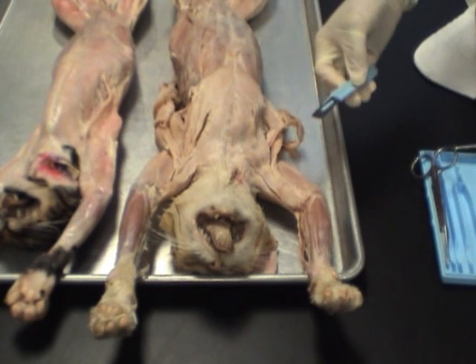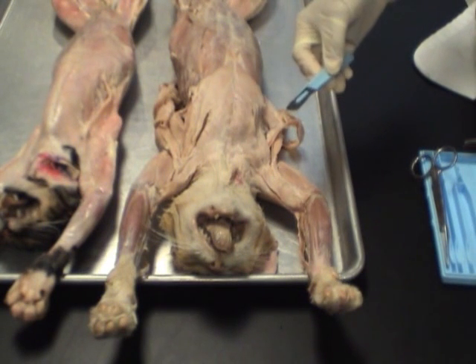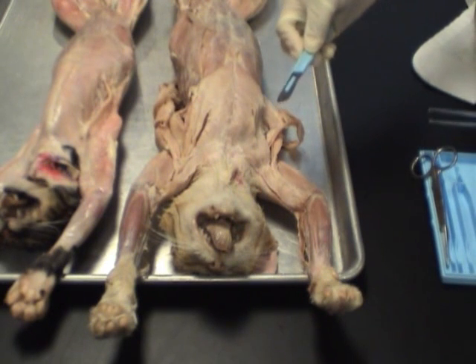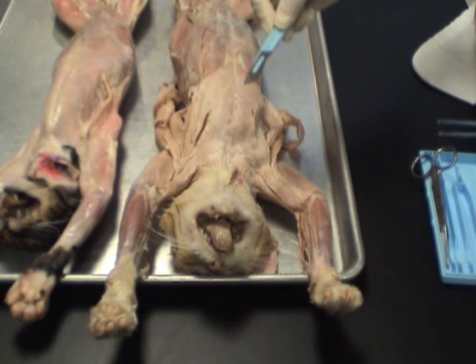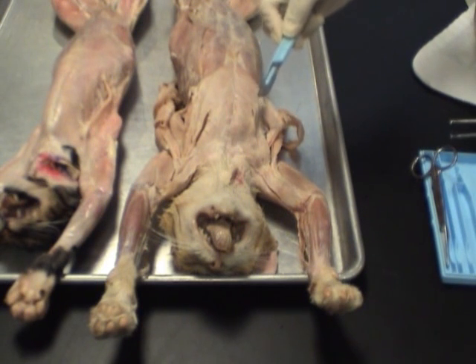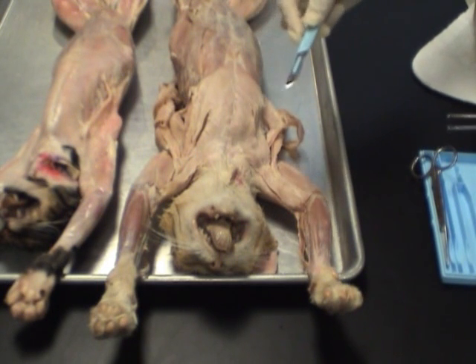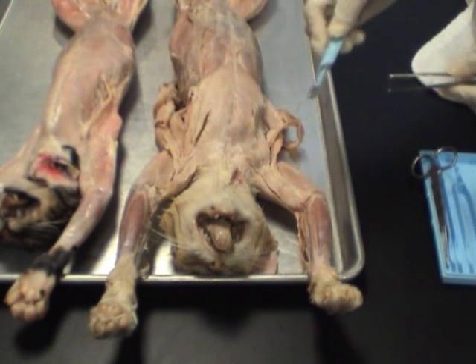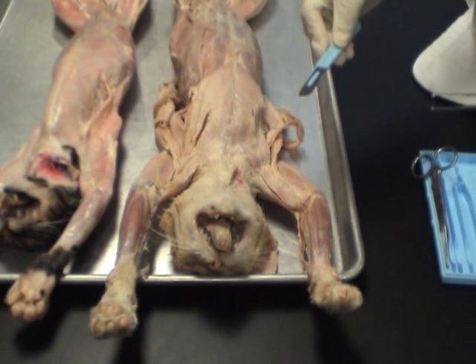I will use the scalpel as the last resort. Because if you're going to be cutting, unless you know exactly what you're cutting, the scalpel oftentimes does more damage than good. You will cut things that you want to keep accidentally, and then it's too late. You can't exactly sew it back. So always use the scalpel as the last resort.